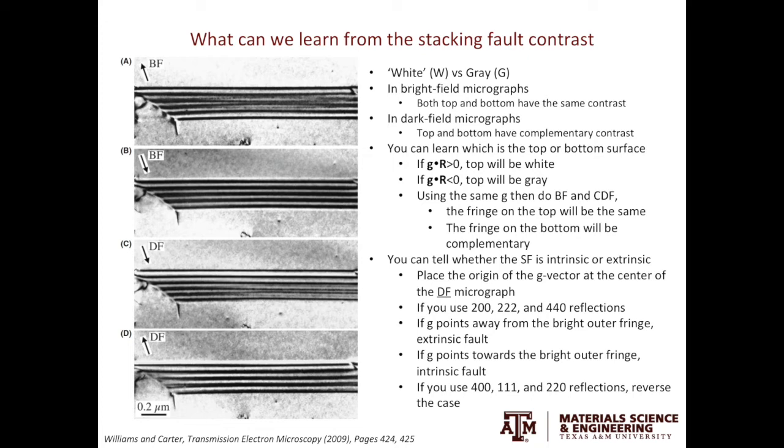Also, based on the 4 micrographs on the left-hand side of the slide, we can work out how the stacking fault cuts through the specimen. For example, on which side the stacking fault cuts through the top surface of the specimen, and on which side it cuts through the bottom side of the specimen. We can also tell whether the stacking fault is intrinsic or extrinsic. I will not expand on it here. If you are interested in this part of stacking fault imaging, you can pause the video and read the notes I prepared for you on the right-hand side of the slide.